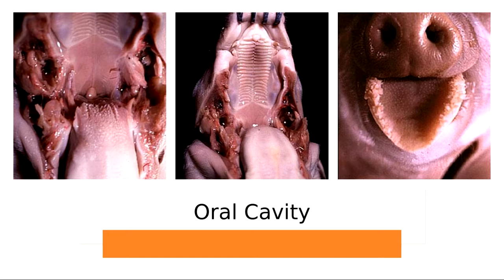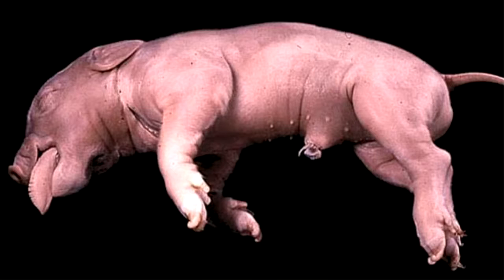So here is the oral cavity, after you have looked at the external anatomy of the fetal pig. Oh, and by the way, a few other things here. Your lab manual might ask you to check for hair. There'll be a couple of hairs right on the chinny chin chin there. Some fetal pigs have fur all over the place.